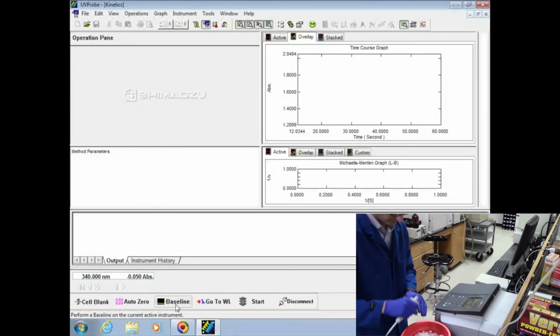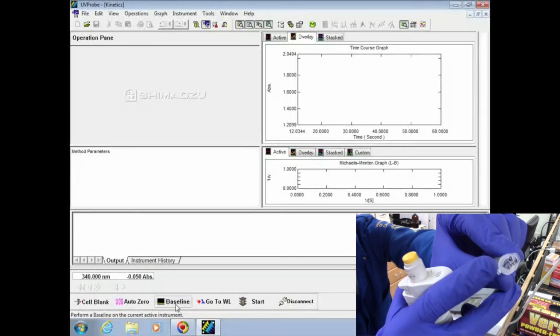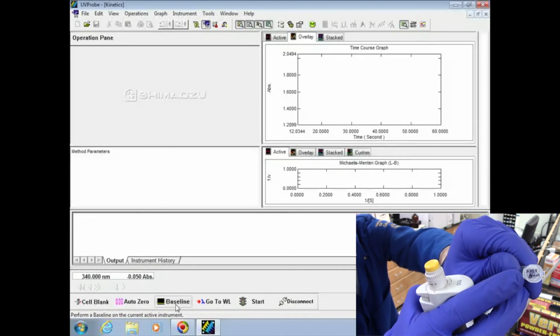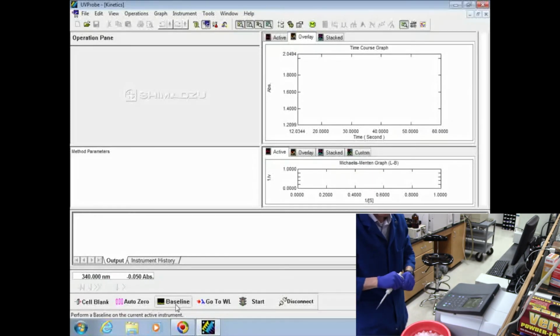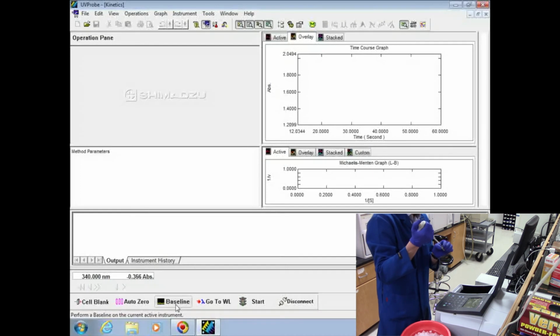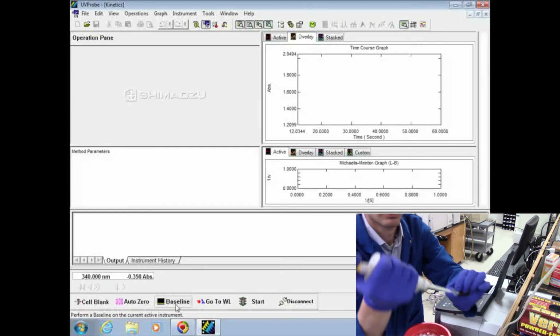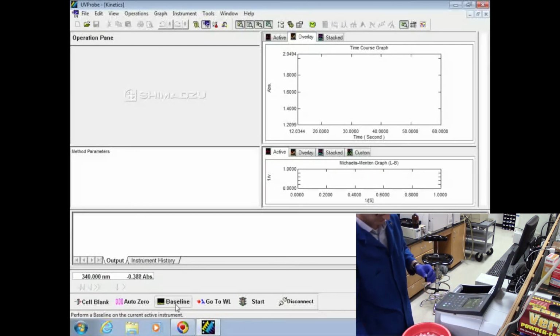Next, we need to begin pipetting our calculated reagents into the cuvette. Since buffer's already in there, we'll go ahead and start with NADH. Pipette the calculated quantity of NADH into a cuvette containing the calculated quantity of buffer at the substrate concentration that you're going to begin with. Be sure to mix thoroughly. Place the pipette tip into the cell deep enough so that it is under the surface of the liquid, and pipette up and down several times.